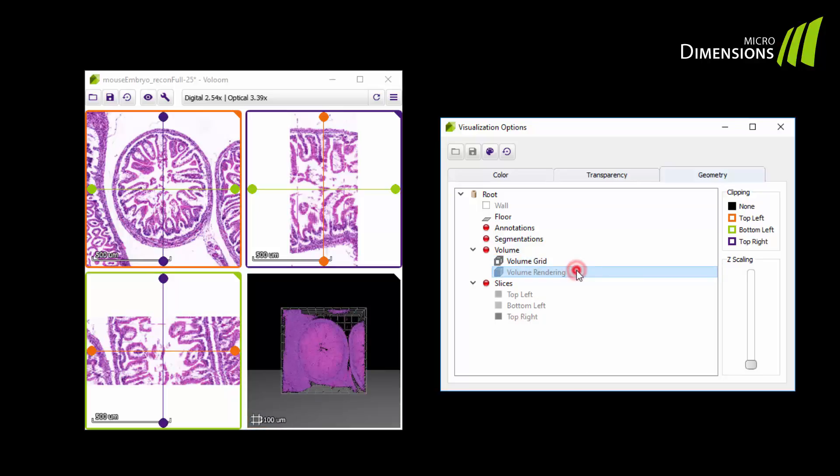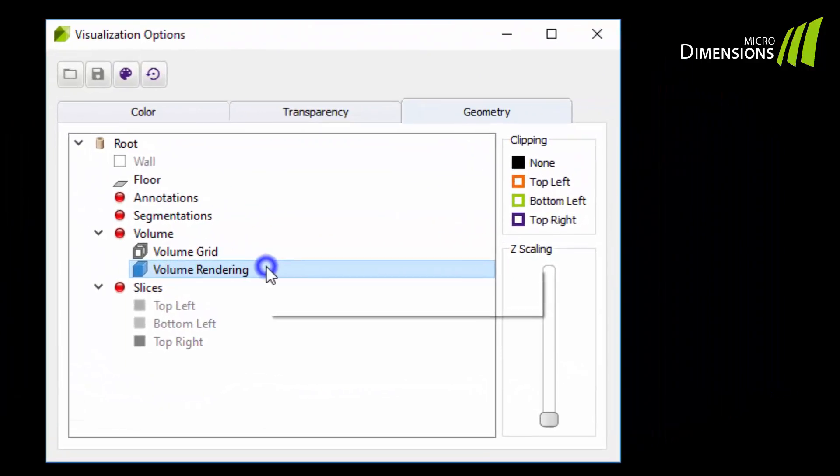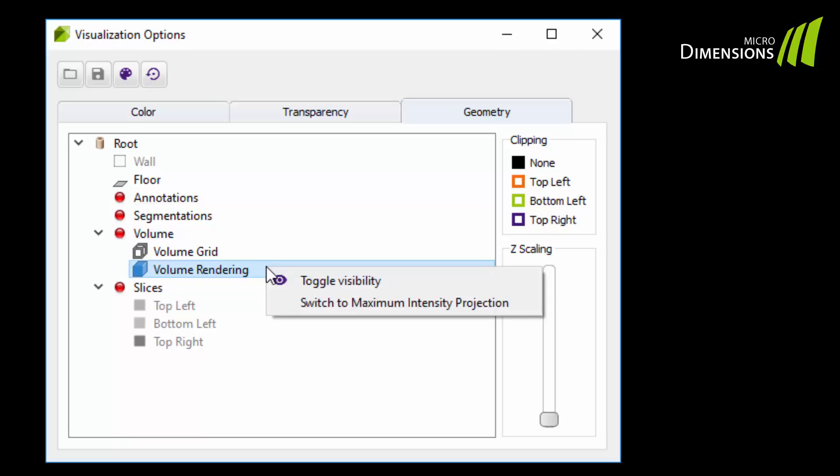If you loaded a fluorescence dataset or are in stain rendering mode, you can right click on volume rendering to open a context menu and select the maximum intensity projection rendering mode.